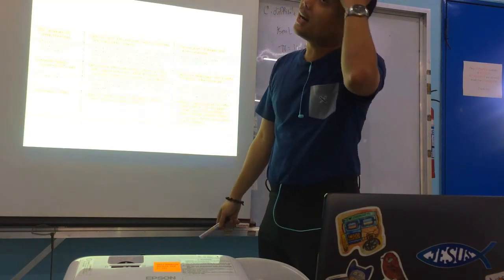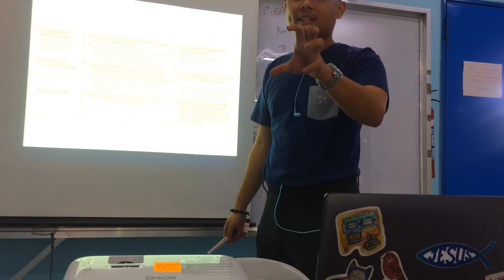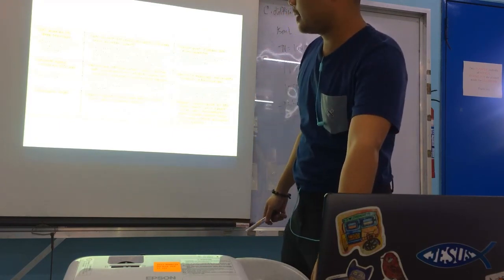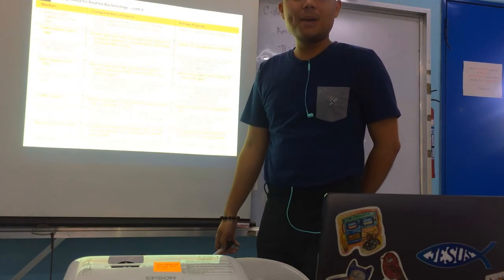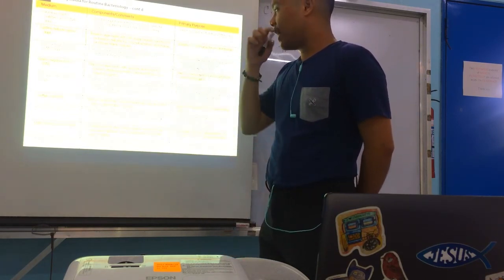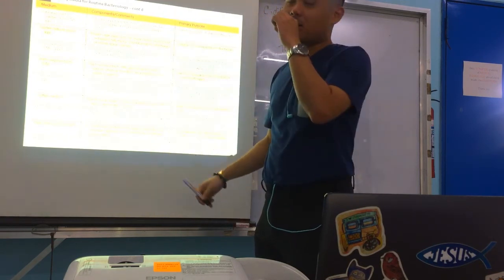Chromogenic means that in the culture media, the colors of the colonies are the indicator, so you can identify the organism. Yes, that's chromogenic. Okay, CNA, EMB, eosin methylene blue or Levine. Again, greenish metallic sheen on EMB, that's E. coli. Alright. Okay, HE agar, we will discuss that in the gram-negative stool culture.